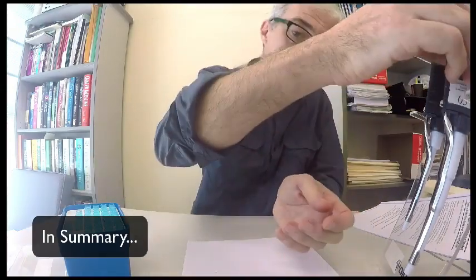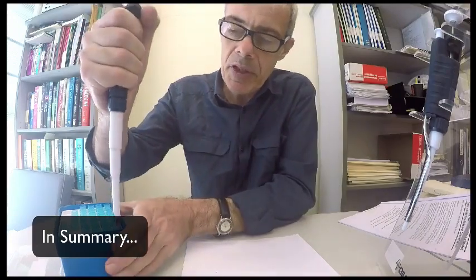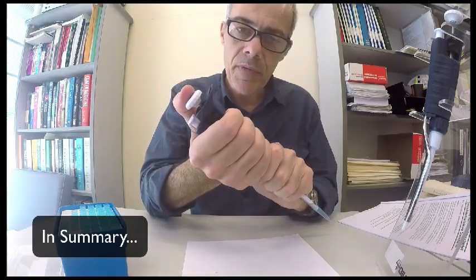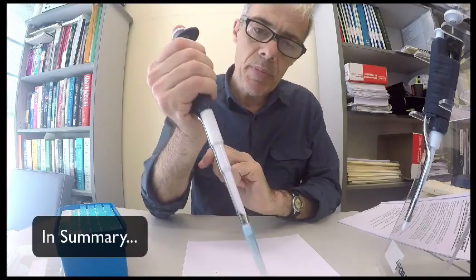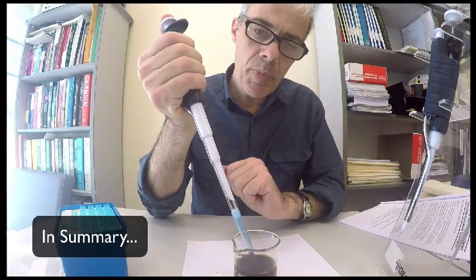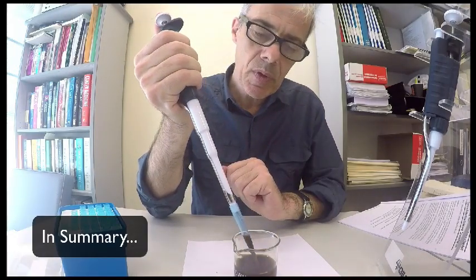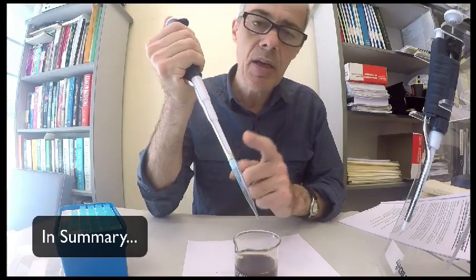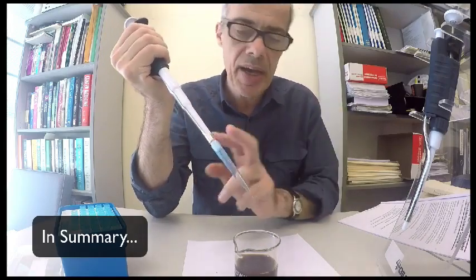When you're using any of these pipettes, you place a tip on, you set your dial to the volume, you then move the plunger down to the calibrated stop, you immerse into your solution, you slowly draw up your solution. I've got a bit of air in there, so I'll just dispense that out. And I'll pay more attention to the solution and not the camera.